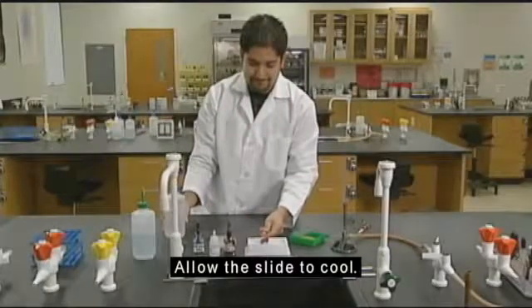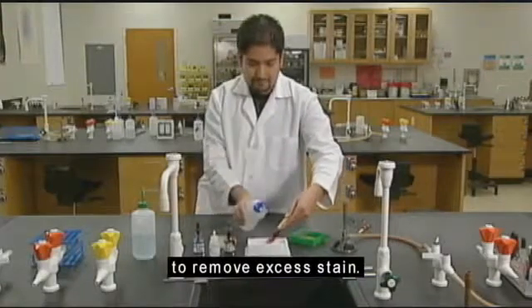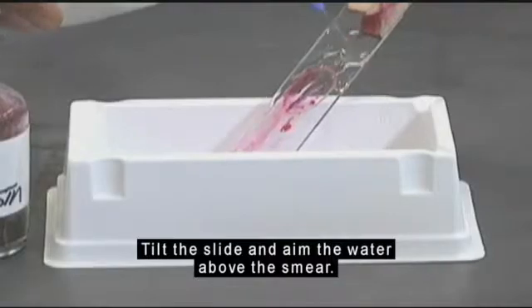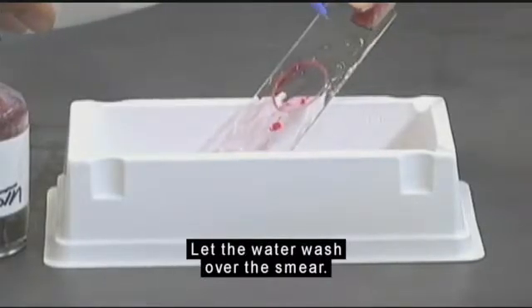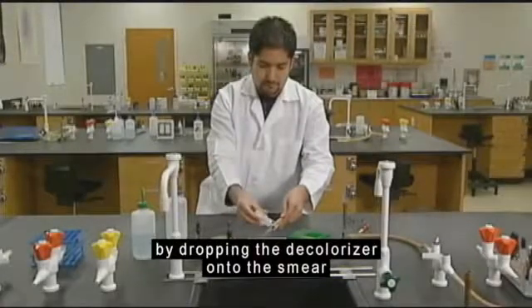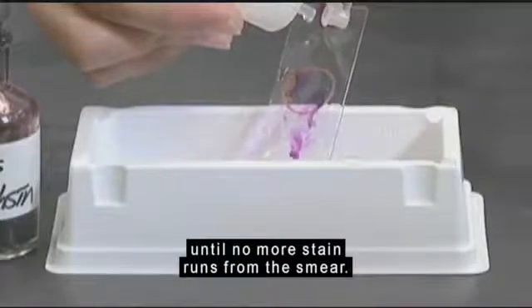Allow the slide to cool. Rinse the slide with distilled water to remove excess stain. Tilt the slide and aim the water above the smear. Let the water wash over the smear. Decolorize the smear with acid alcohol by dropping the decolorizer onto the smear until no more stain runs from the smear.